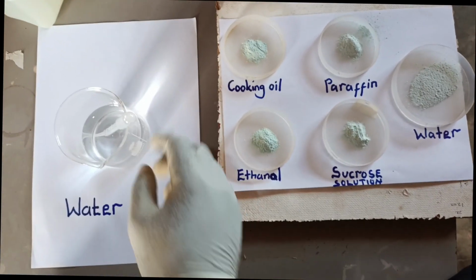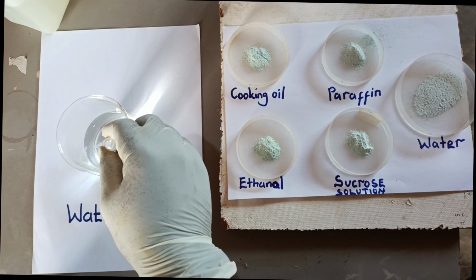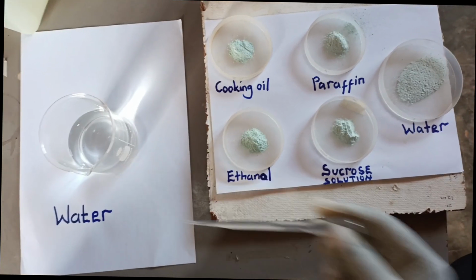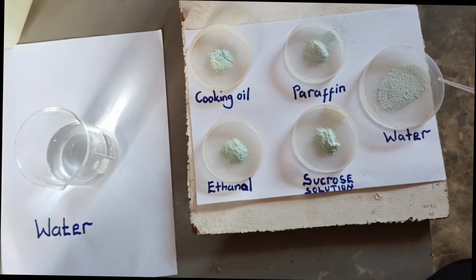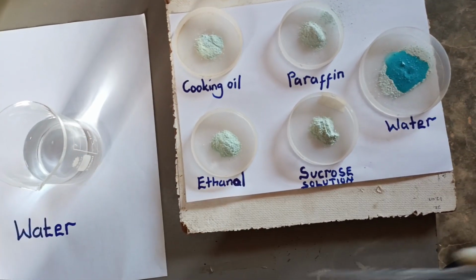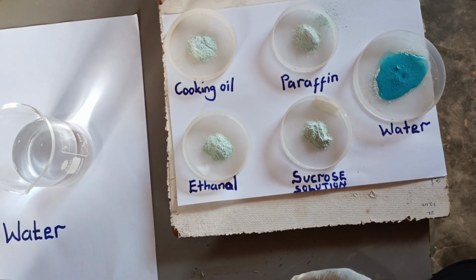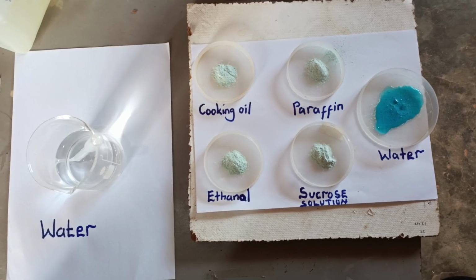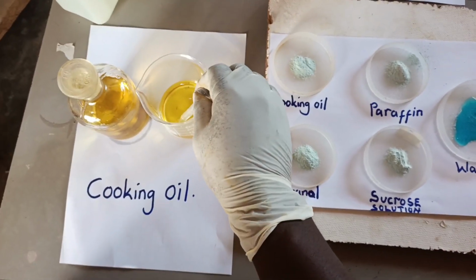We are going to add different liquids on anhydrous copper 2 sulfate to detect the presence of water in those liquids. And let us start with water itself. When few drops of water are added on anhydrous copper 2 sulfate, the white solid turns to blue, as shown in the practical. The next liquid is cooking oil.